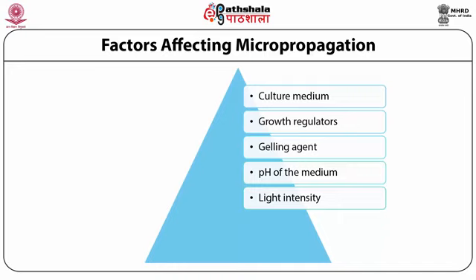As I said earlier, the culture room is completely closed. You don't have even a window. It's the door which opens into the clean area. So therefore, whatever you are giving is artificial. So your light intensity should be adequate to induce photosynthesis if possible. Keep them green and make them grow.